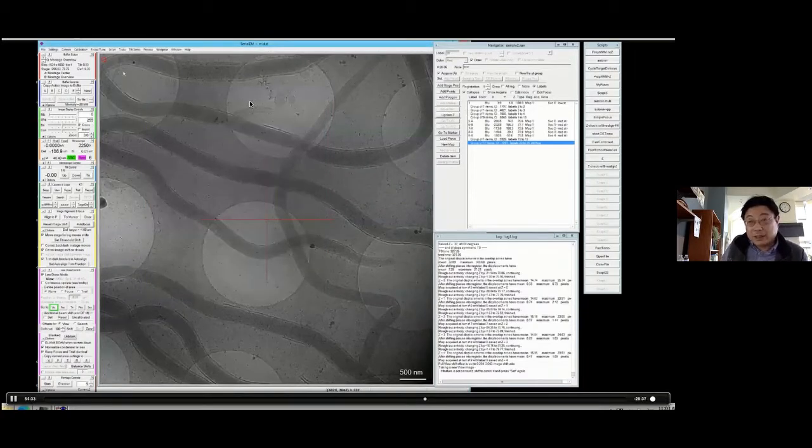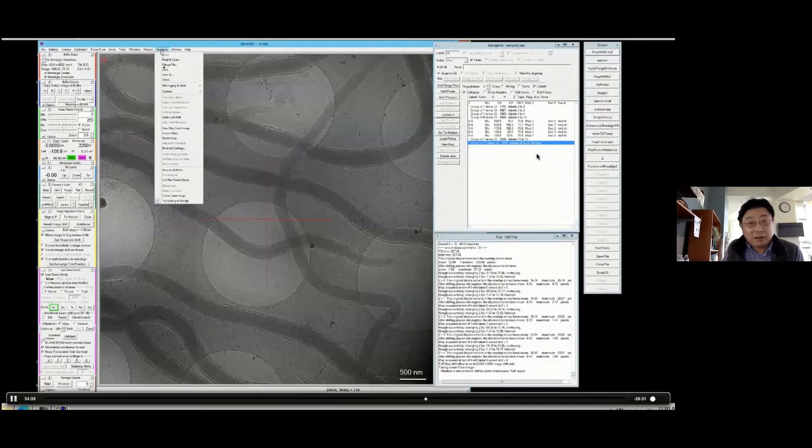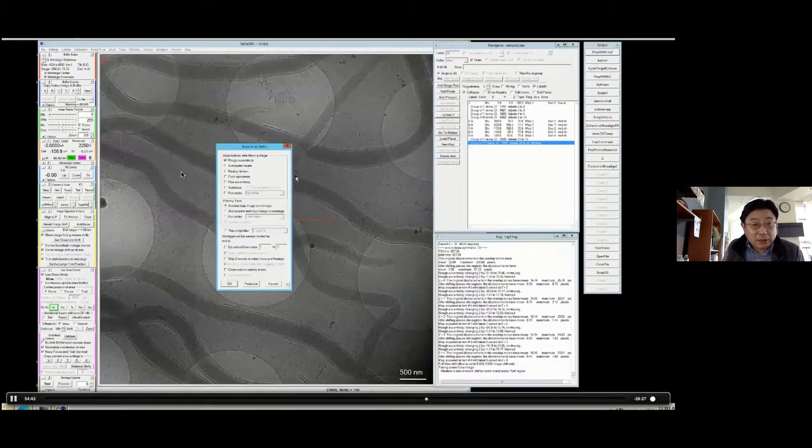With this in mind, now you're basically ready to collect data, right? You see every place is already marked A. To collect data is exactly the same as before, except now we skip this. We use this open file, so you have a file name. Then you run this fast tomo, then you close the file. So that's all, and we can get the data.